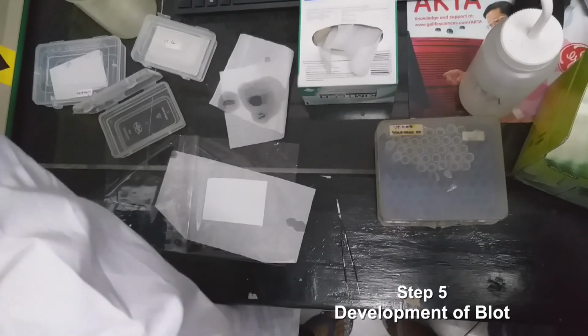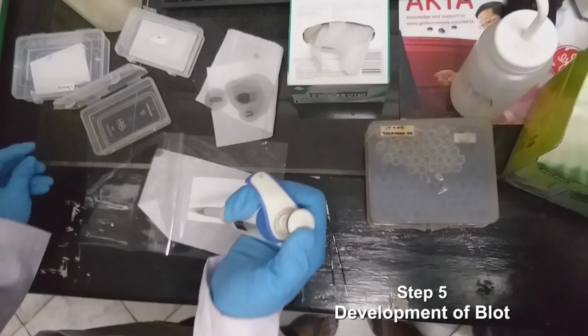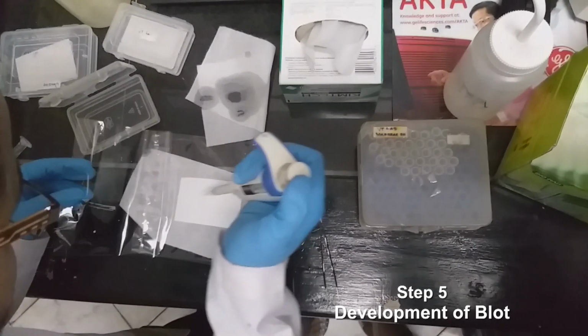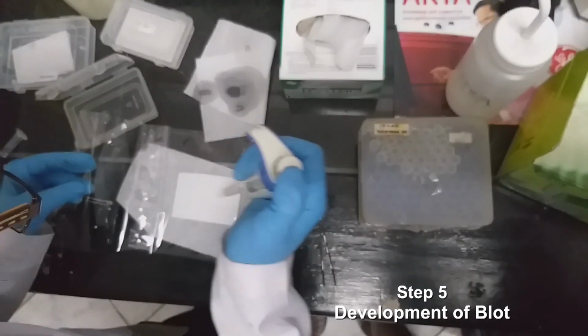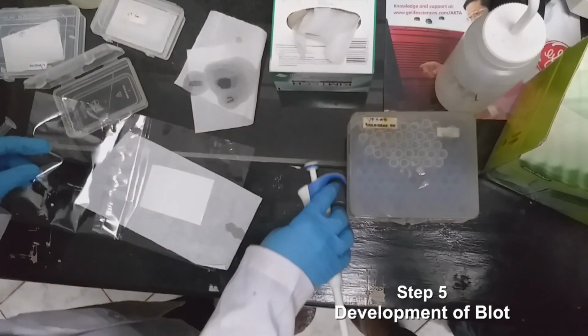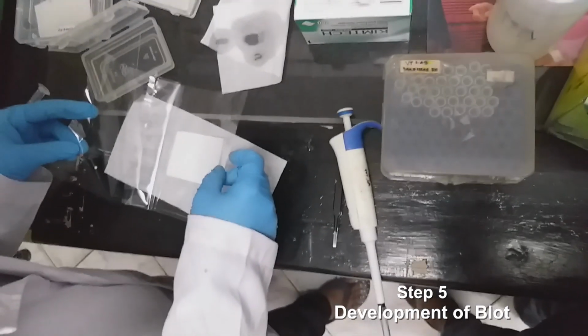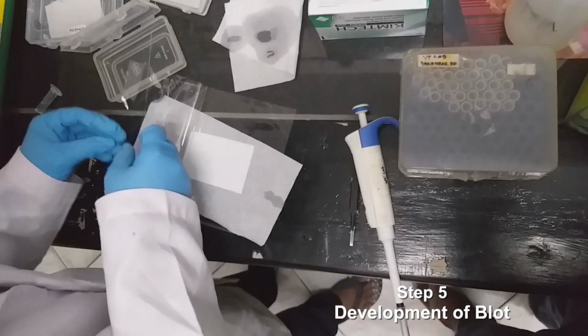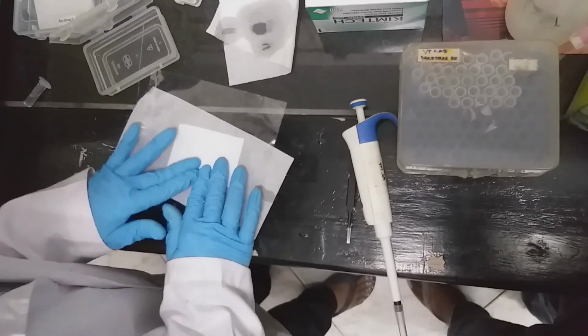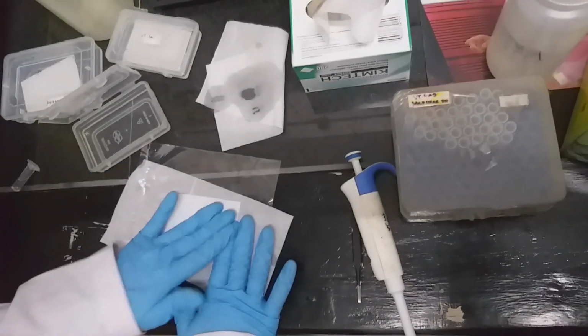Then we take the chemiluminescent substrate, and after that we slowly press and remove air bubbles.